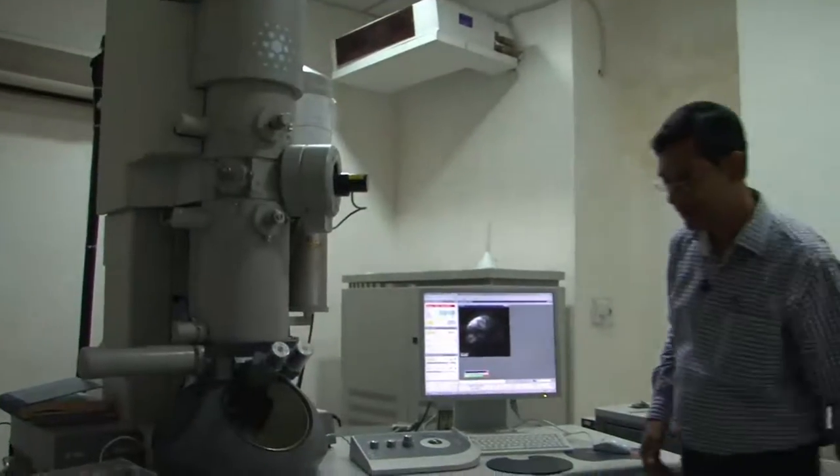So I just take on this chair and switch on the beam here by using the computer, which you may not be able to see. Once I switch on the beam, in the microscope I can clearly see that the fluorescent screen lights up. That means I have the beam aligned in the microscope. Remember, for normal microscopy and high resolution microscopy, the electron beam needs to be aligned properly.